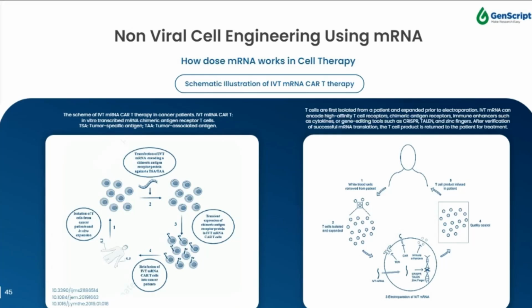From the last few years, a growing number of researchers are exploring in vitro transcribed IVT mRNA for the development, testing, and application of T-cell based immunotherapeutics. mRNA can be used for both reprogramming of T cells as well as gene editing with the CRISPR-Cas9 family of nucleases. As shown in figure A, reprogramming of T cells using mRNA to create CAR T cells that target specific tumor-related antigens is emerging as a safe therapeutic approach. It can also be used for ex vivo gene editing, such as with the CRISPR family, and this technology offers improved precision of gene editing as shown in figure B.